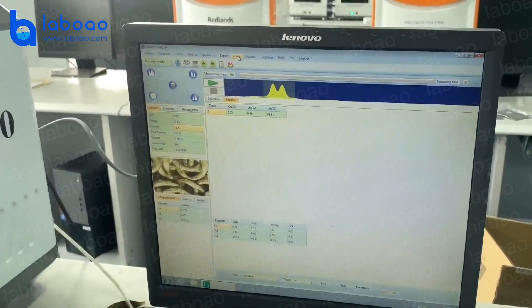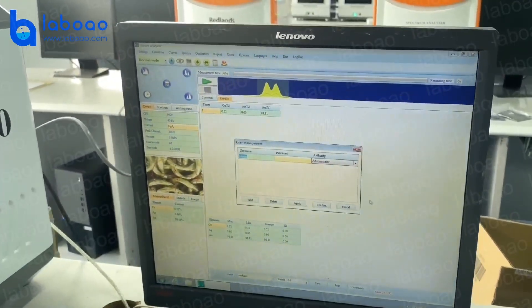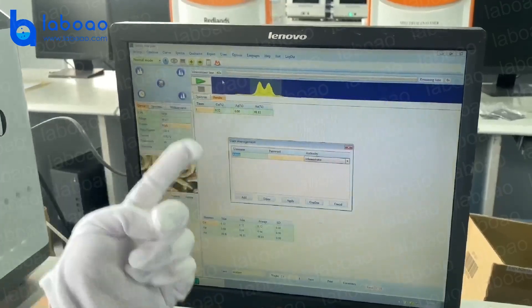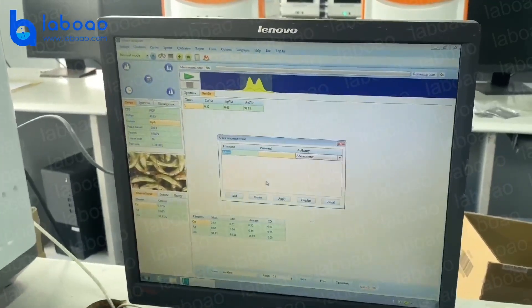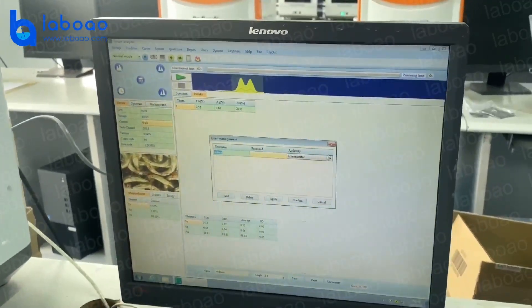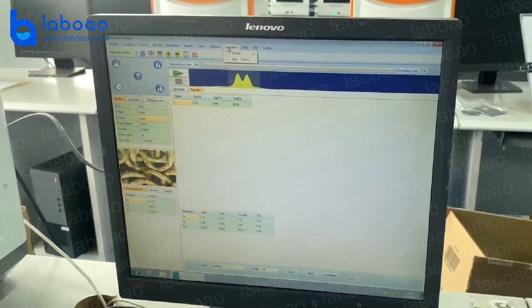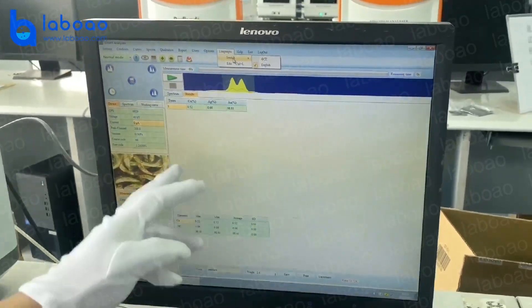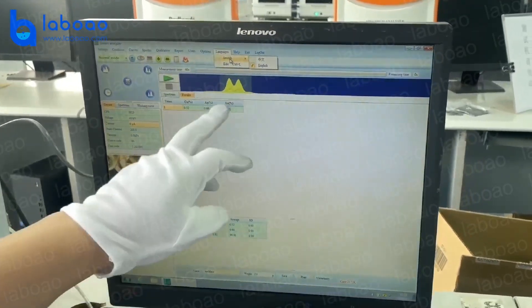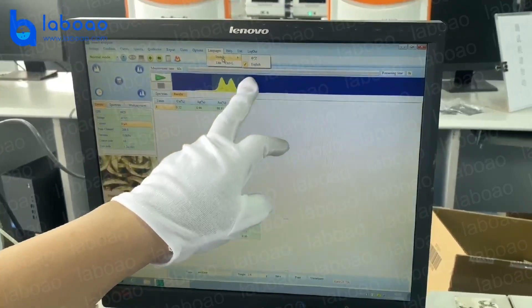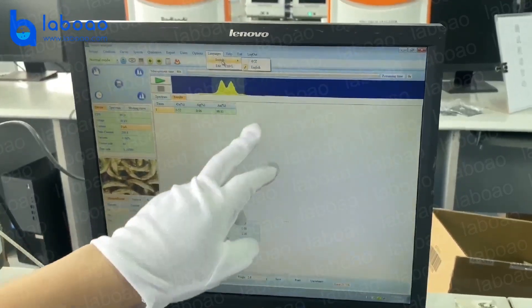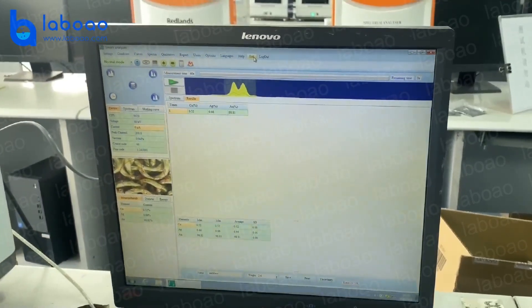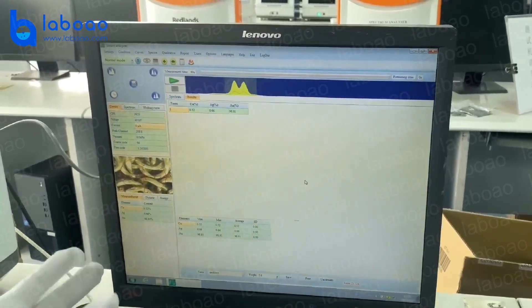We have user and administrator modes for customers. Here is the function menu where you can switch language. We currently present Chinese and English, but we can also support other languages. That's all for this software.